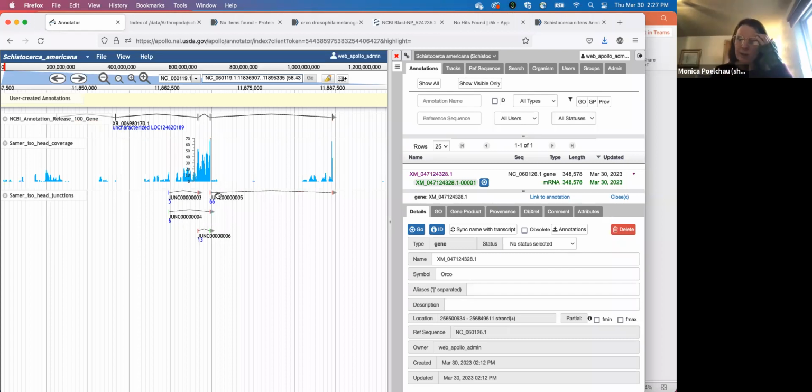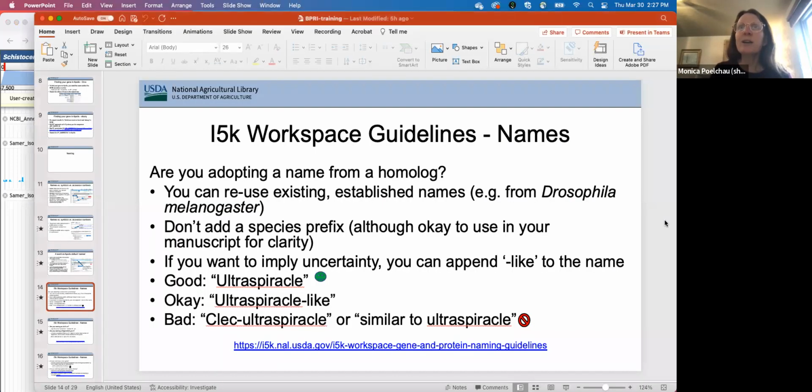Sometimes there's information there that you can use, and there's also KEGG-based information, which, as Anna says, you've got to take with sometimes a shaker full of salt. So if you actually do choose to change a name, in the case of uncharacterized whatever, unless you have good experimental evidence where you think, yeah, I can change this, you probably don't want to do it. But if you do think you have enough information, then here are some guidelines.